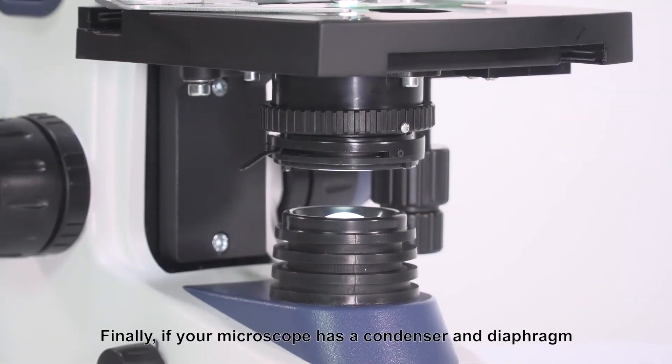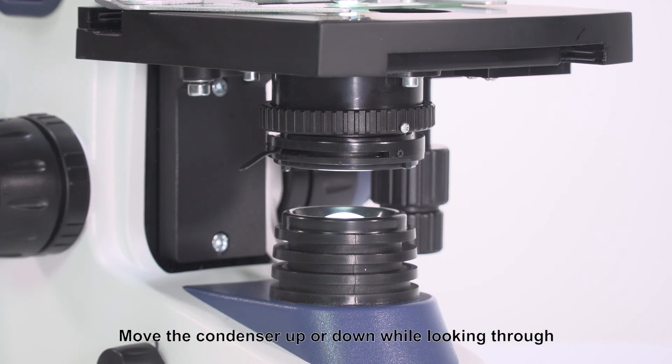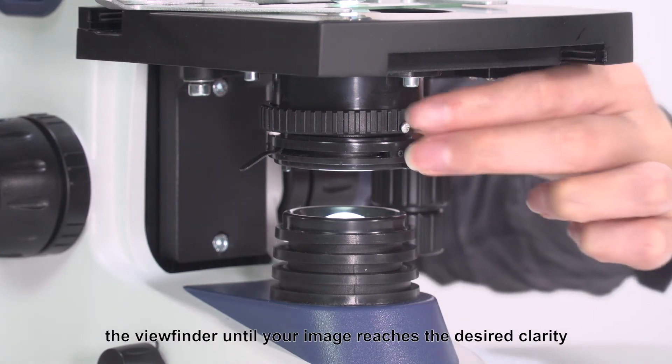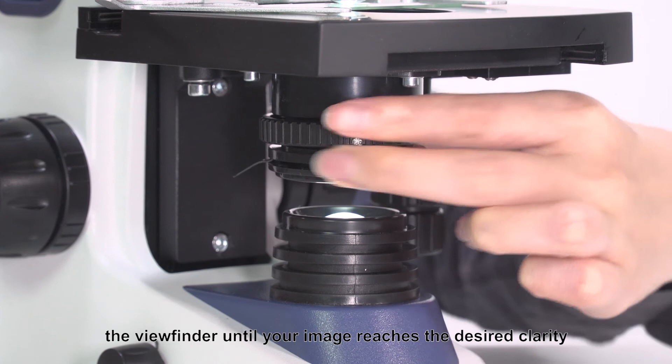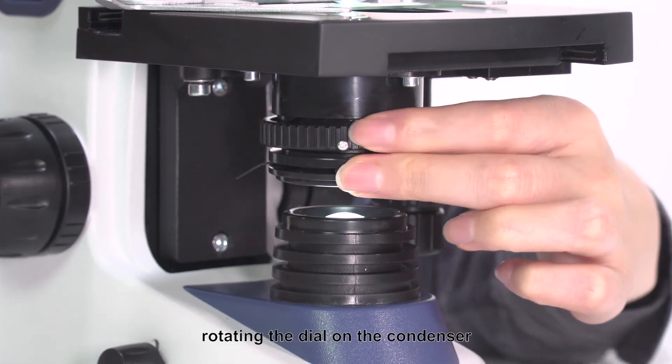Finally, if your microscope has a condenser and diaphragm found beneath the stage, you can use them to focus the light on your specimen for a sharper image. Move the condenser up or down while looking through the viewfinder until your image reaches the desired clarity. In this case, the condenser is moved through rotating the dial on the condenser.